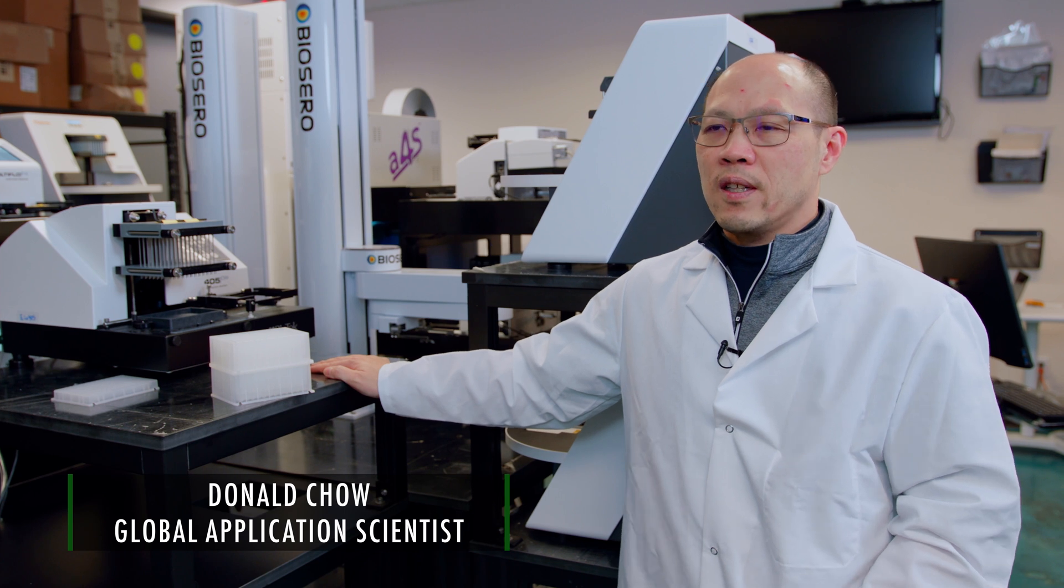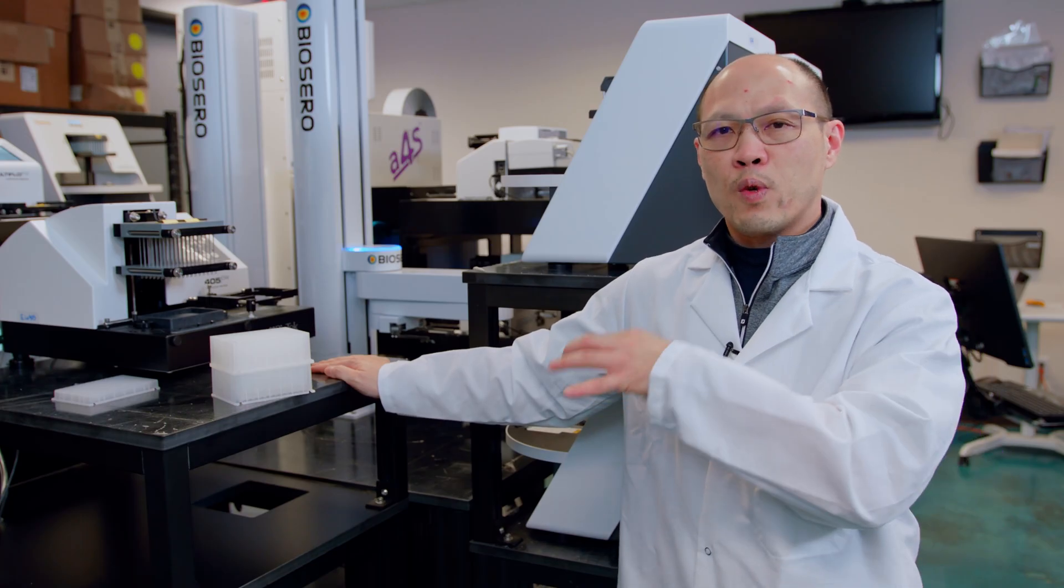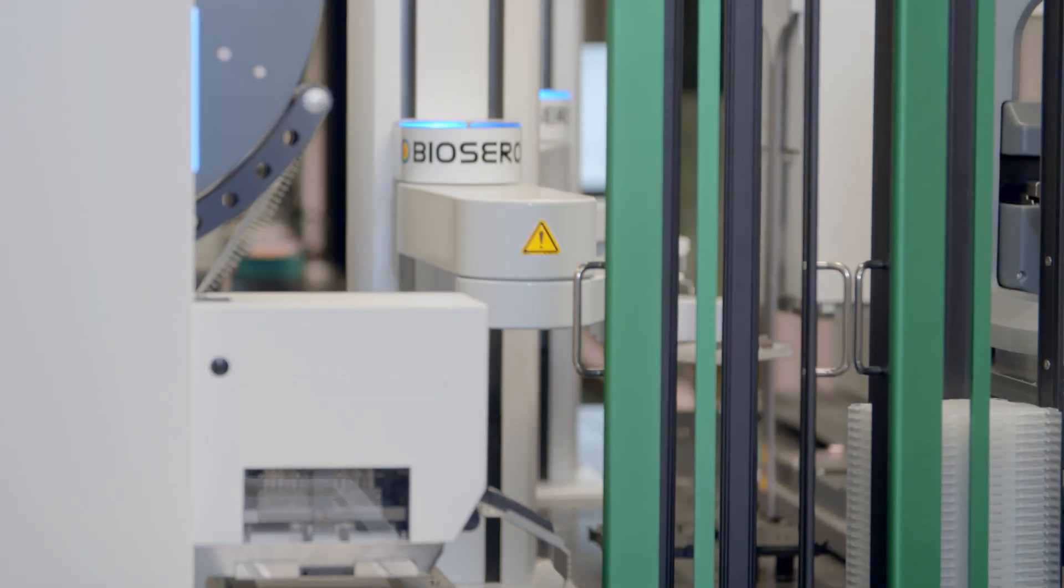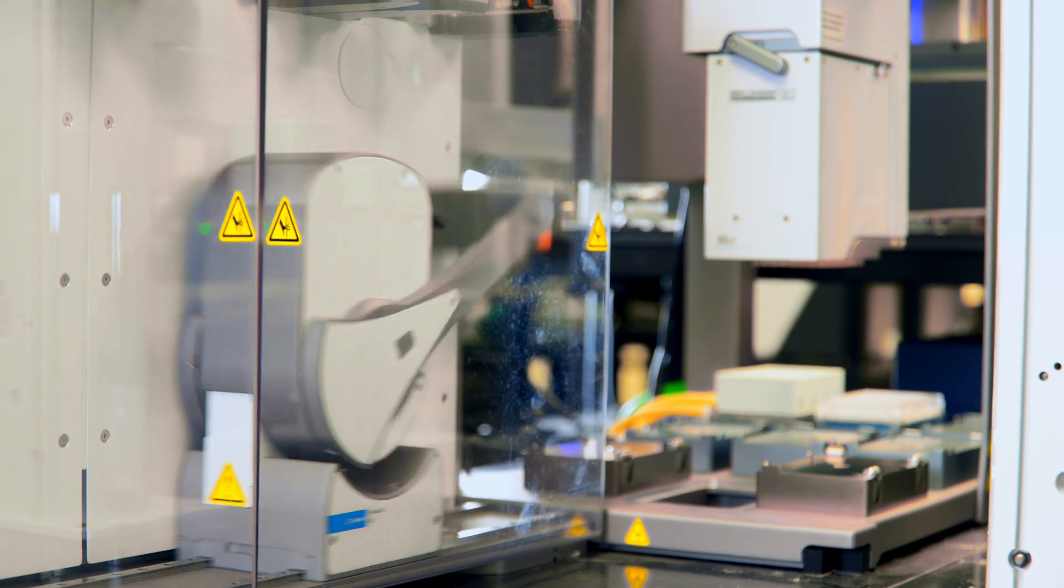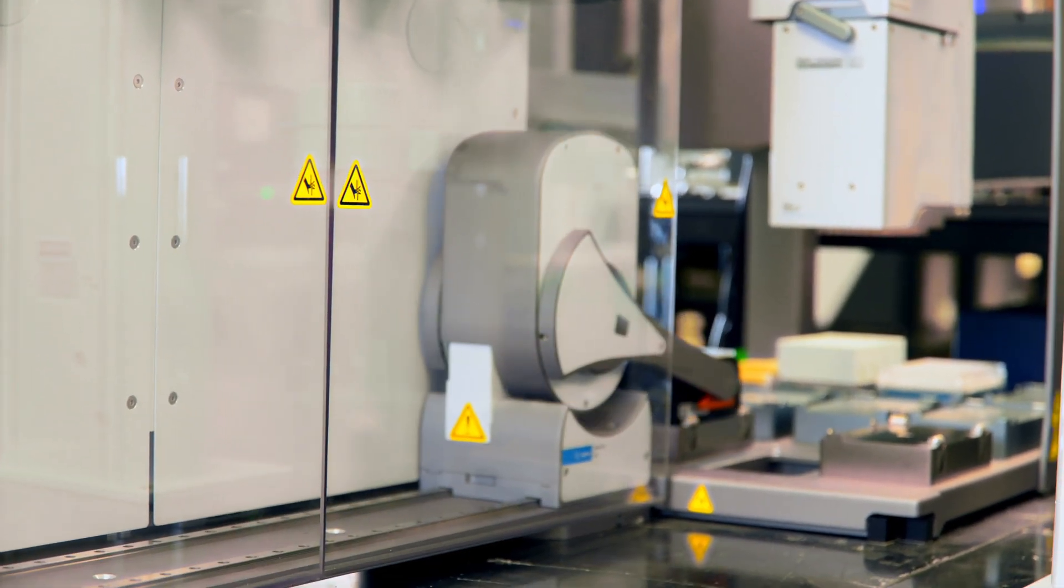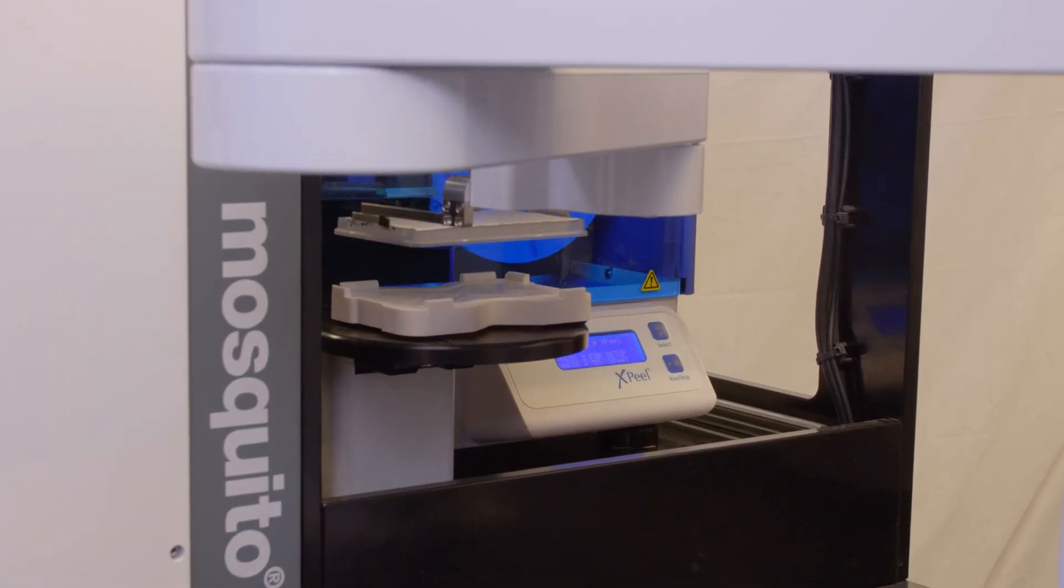There are three work cells in this particular design and it flows from one system to another. It's not necessarily frontline testing, but the depth of information that you get from this kit is much deeper than your standard frontline test.